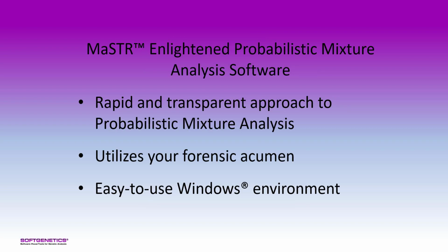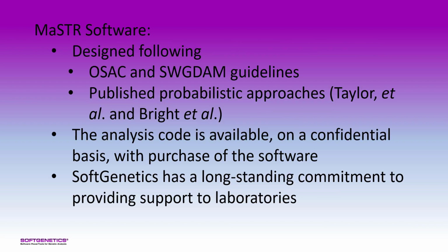MaSTR Enlightened Probabilistic Mixture Analysis software features a rapid and transparent approach to probabilistic mixture analysis, which utilizes your forensic acumen in an easy-to-use Windows environment for research, validation, and casework applications. MaSTR software was designed following OSAC and SWGDAM probabilistic guidelines and published probabilistic approaches. The analysis code is available on a confidential basis with purchase of the software.